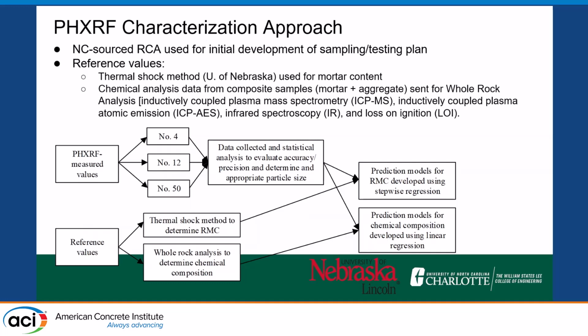And then to see if we could get those values or predict them using our handheld XRF measurements, we considered a number of different factors. We ended up working with 3 different size fractions, and I'll explain a little bit about that once I move forward here on the slides.